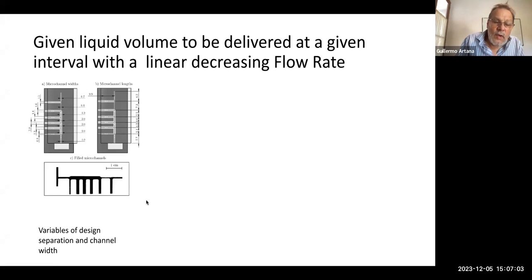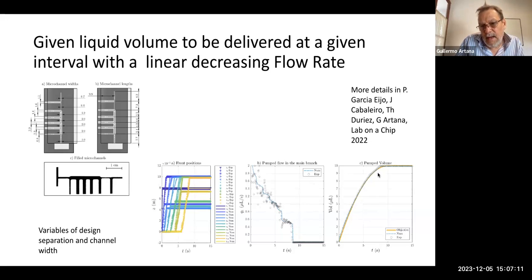In this case, instead of having a linear volume increase along time, the second case is a case in which we have a parabolic volume that is being filled over time, and again we have experiments and numerical results. And in this case, what we have changed is that we have also allowed to vary the length and the size of the channels.